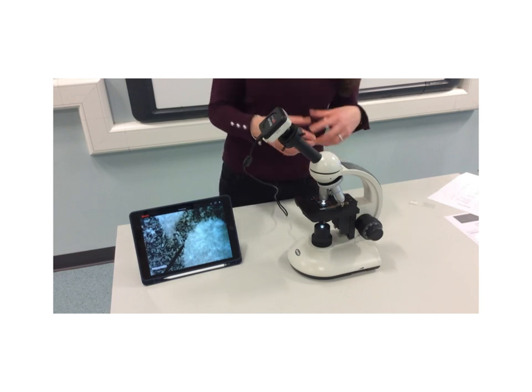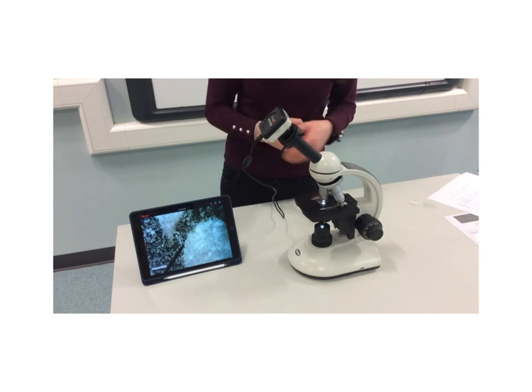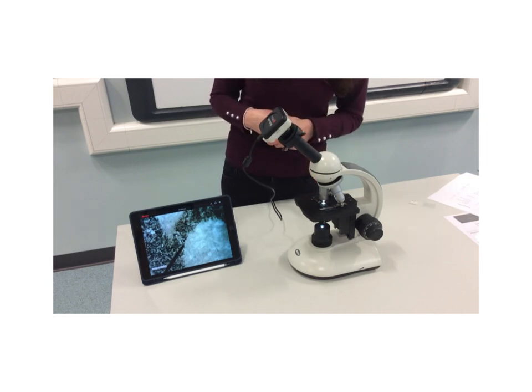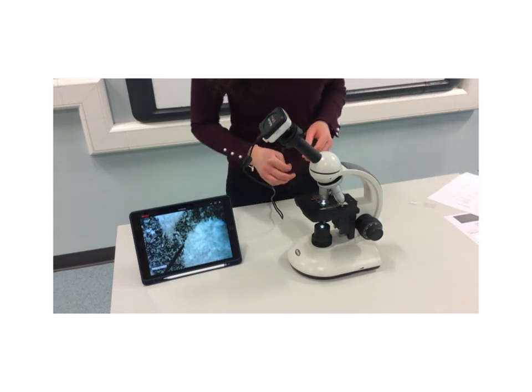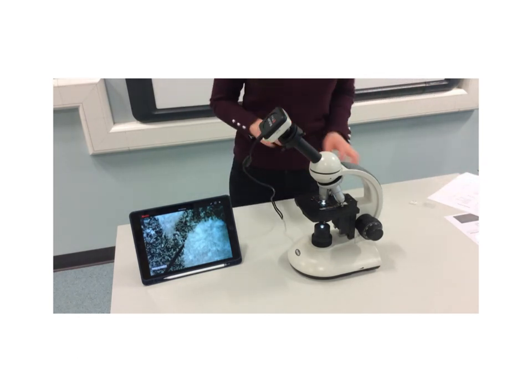The first one we looked at was making it 40 times bigger. This one is making it 100 times bigger. So what I want you to do is to have a wee look at page 3 of your notes, and I'm going to actually switch this slide here.